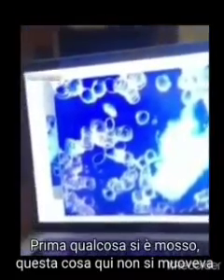It's sort of got a life on its own. Definitely was something alive. Was it moving live? This thing here wasn't moving, but these things. So this crystallized structure here, it's not that they were moving like this, but they were kind of growing. Growing, sticking out, right? Yeah. Wow. This is insane, guys.